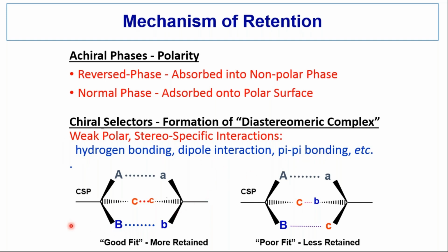So in this example, if we have a stationary phase which has, just to make up examples, say a hydrogen bond acceptor, and this is a pi base, and this is a dipole. If we have a hydrogen bond donor and we have a pi acid and we have the dipole of the opposite orientation, these will interact strongly, and so there's a good chance we'll have good retention.